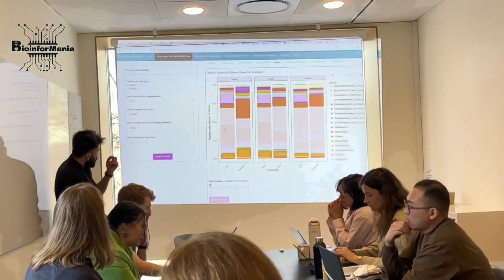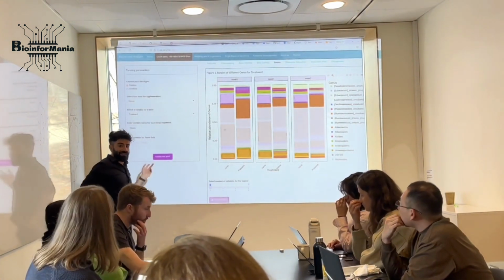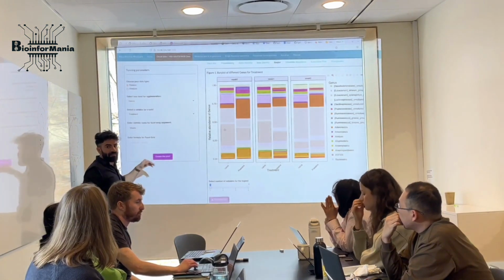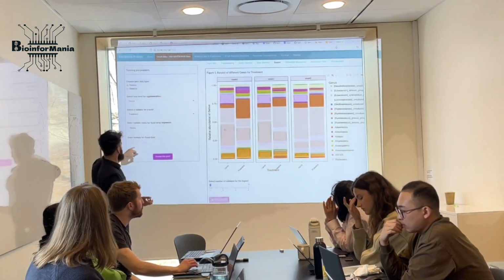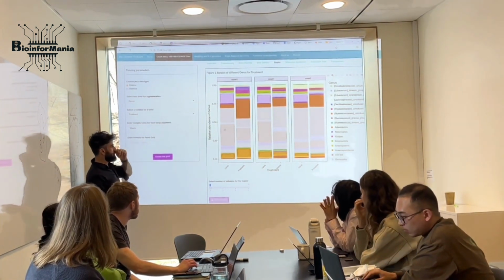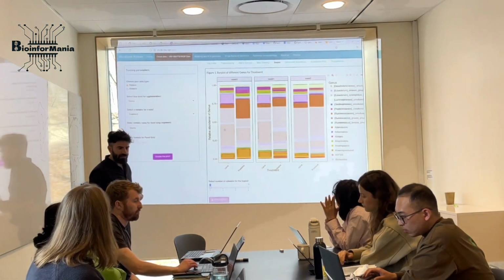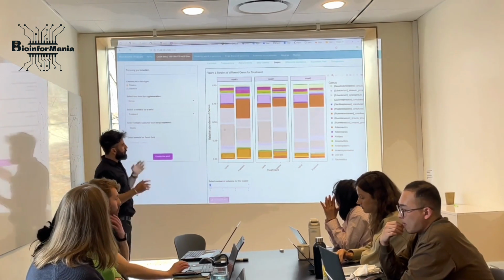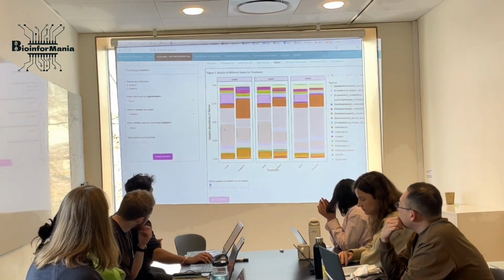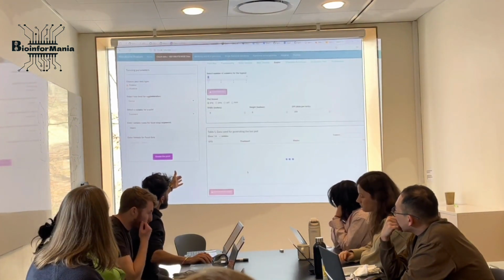You can add a grid as well here. So let's say if you had another variable, you could create a multifaceted plot with different rows in the grid as well, like this. But this one needs to be empty. Delete this. I don't think I have anything else to show you that has enough levels. But anyways, that's one thing. I try to show all the possible options. Otherwise, you can download the table down here.